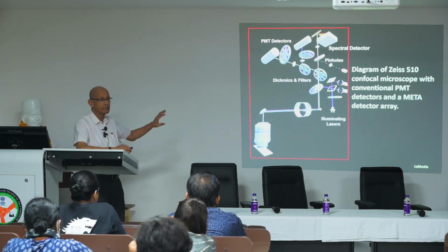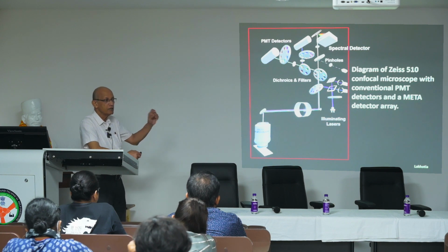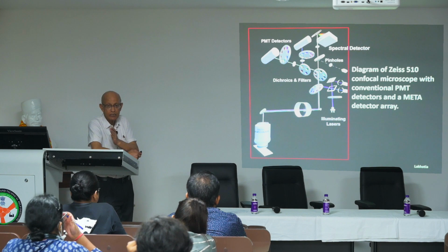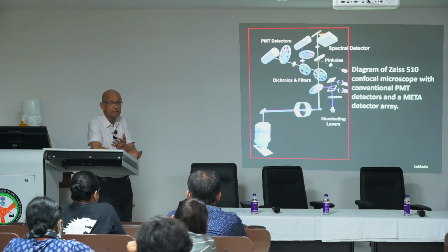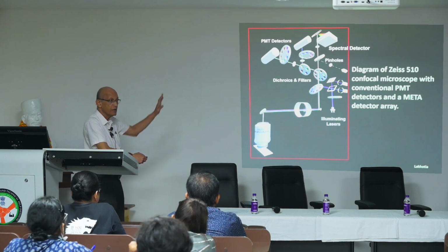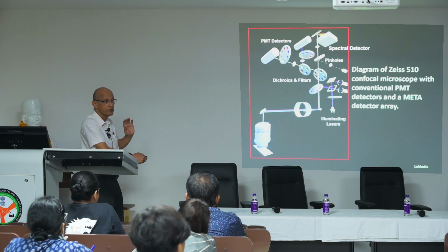And the scan head has a mechanical system that will work immediately and in a very fast way. It can't take time. It must be absolutely a time that you can't detect. Fractions of a second, it must move these filters to the right position and send the light to the given direction.